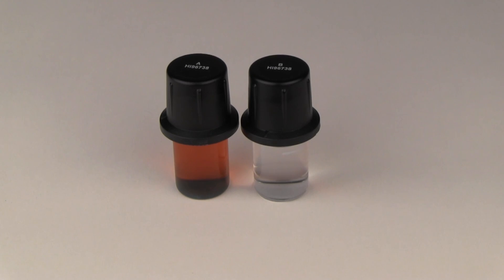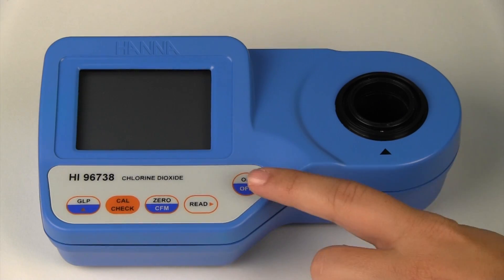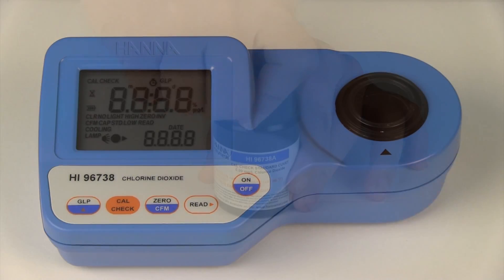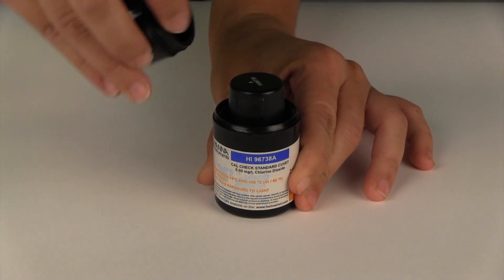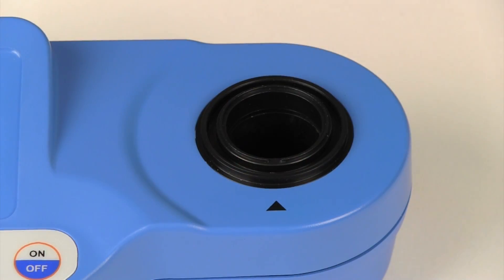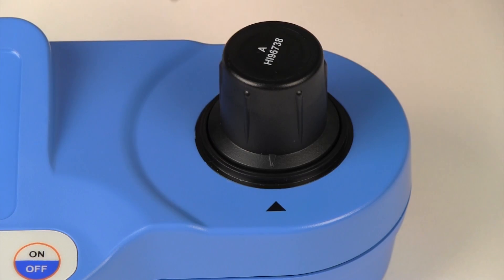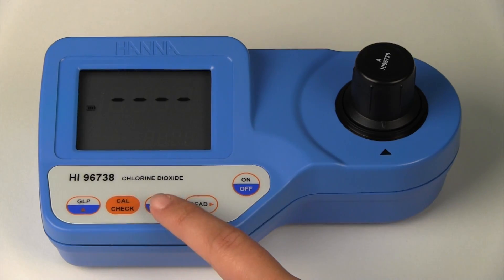Before we perform a calibration check, we need to zero the meter. Turn on the meter by pressing the on button. Remove the HI-96738A zero milligram per liter cuvette from its container and wipe it of any dust or prints. Put the cuvette in the meter and index it by lining up the notch in the cap with the groove in the meter. Press the zero button to zero the meter.